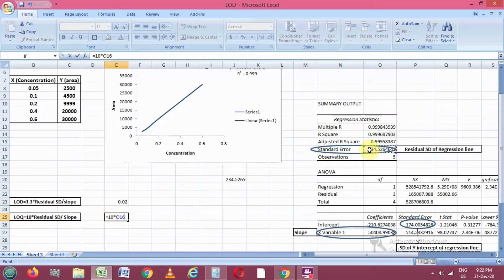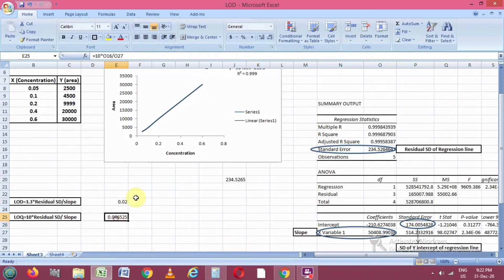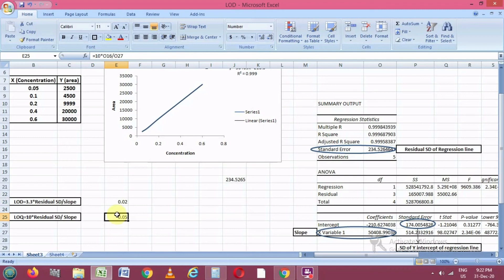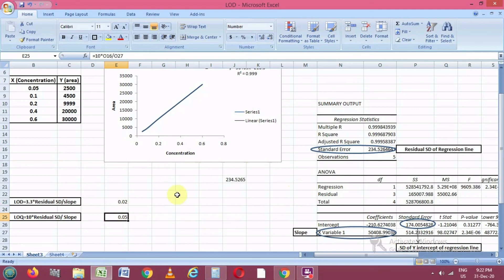We now have the two formulas: for LOD, it is 3.3 multiplied by the residual standard deviation of the regression line, divided by the slope. For LOQ, it is 10 multiplied by the residual standard deviation, divided by the slope. Entering the LOD formula — selecting the standard error value and dividing by the slope — gives us an LOD of 0.02 for these concentration and area values.